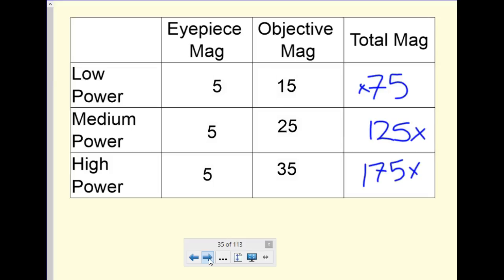Once it shrivels up, you don't see much. You will need a cover slip. I usually take the cover slip and gently flatten the onion skin so that there are no wrinkles, and then put the cover slip down so the onion skin is fairly secure underneath.